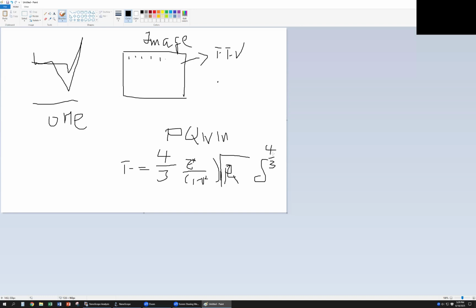This formula is the one we gave this morning. This is called the Hertz model. From this, we know we have three kinds of parameters we must know if we want to calculate this modulus value.